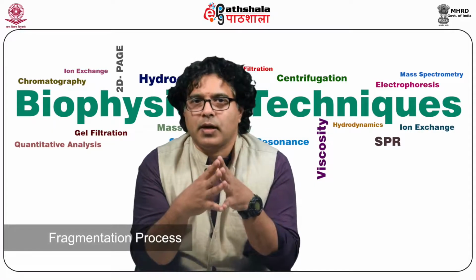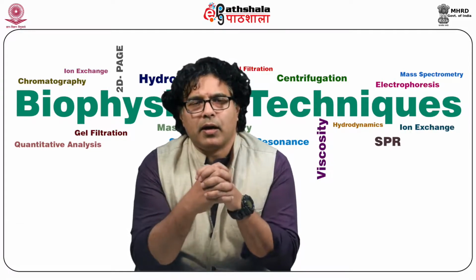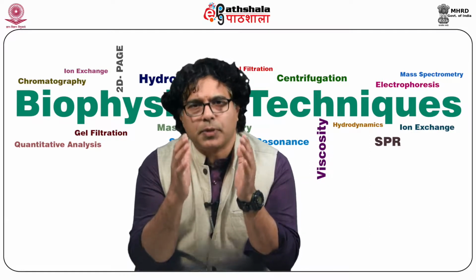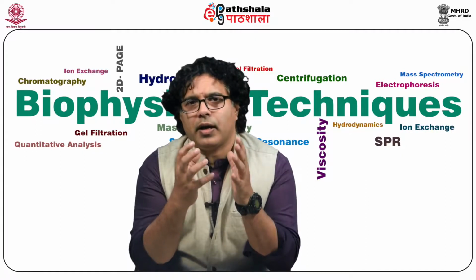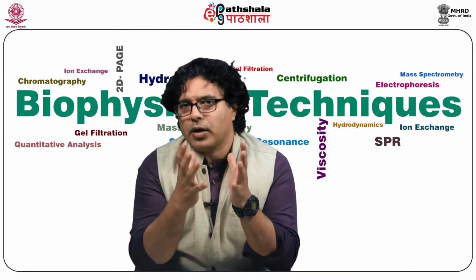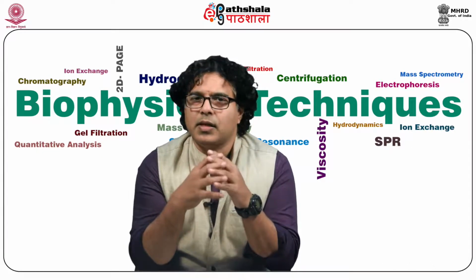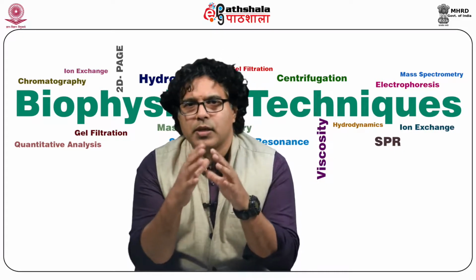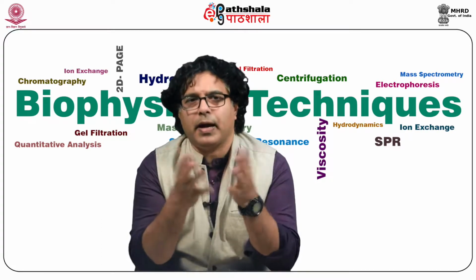Fragmentation process, in which the mechanism involved has been explained by Bowie's rules. Fragmentation, when it is happening in quadrupole 2, when the pseudo-molecular ions are colliding with neutral gas molecules, the weaker bonds are broken and intermediates are getting formed. So, well, this is something which is very difficult to explain, but Bowie's rules somehow conclude that there are some general rules which are happening in that.